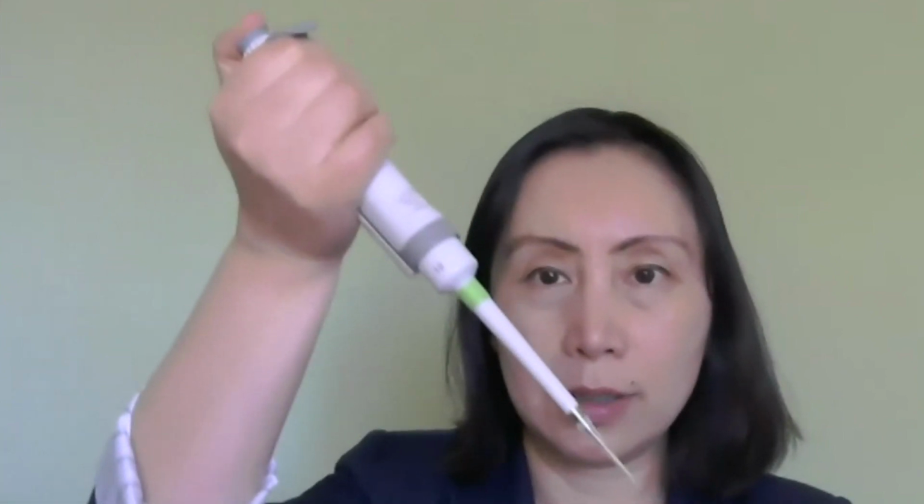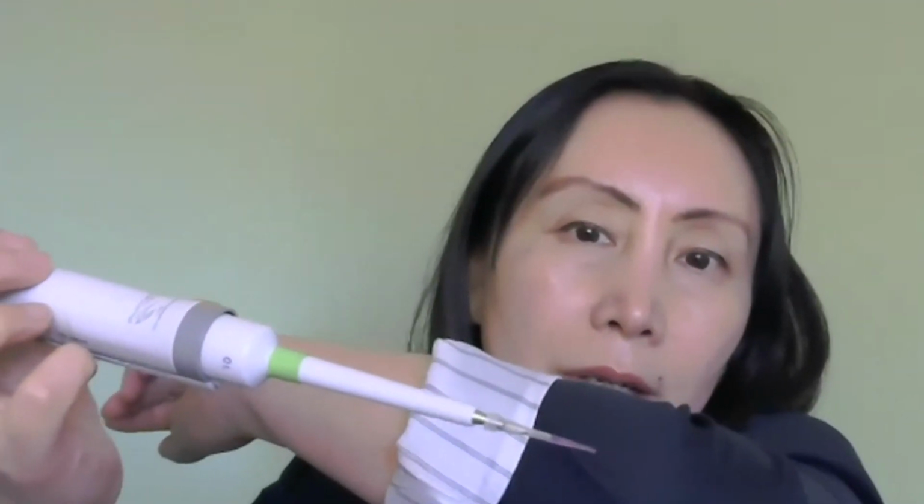So this is the PCR tube. I finished the PCR and just finished the reaction. I get it out of the machine, press down my thumb to the first stop, get into the liquid, and then release it slowly. Now I get 10 microliter of PCR product.